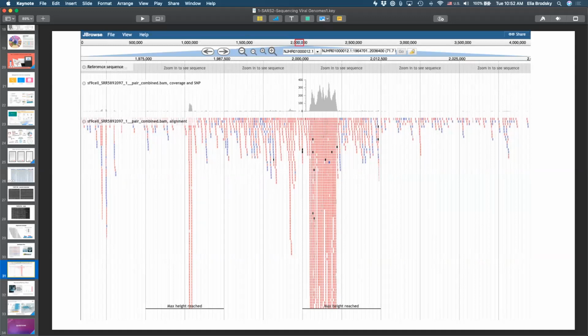Okay, for SARS-CoV-2 sequencing, what kind of sequencing is done, like metagenomics or RNA sequencing? So it's an RNA virus, but there are different techniques, like we mentioned. We'll talk more about specific examples, because different use cases will have different examples, right? So let's look at that in just a minute here.